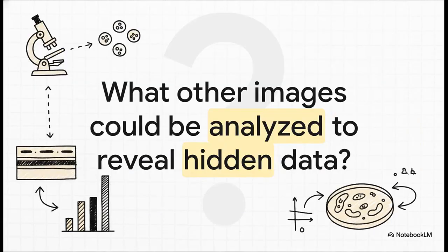And that brings up a really cool final thought. Now that you have this powerful skill for turning images into data, what else could you use it for? Think about it. What about all those microscopy images or cell counts or other assays? Where else in your research is there hidden data just sitting in an image, waiting to be quantified?